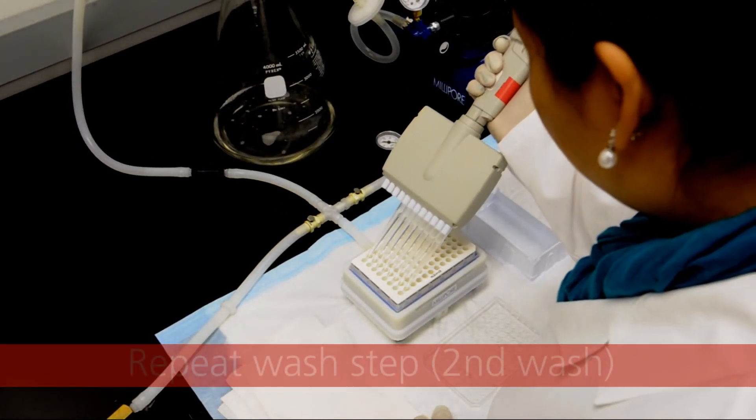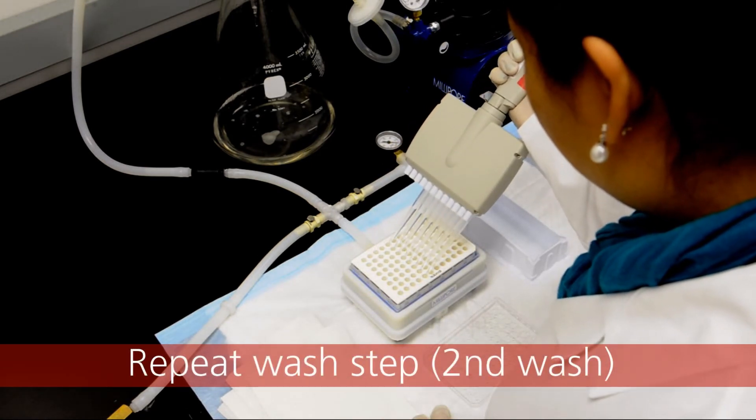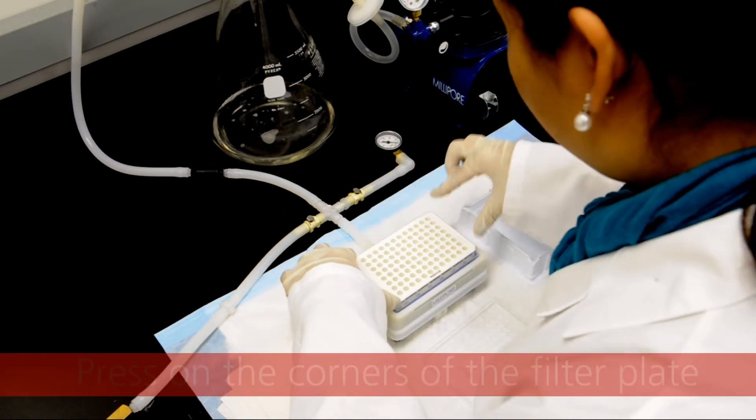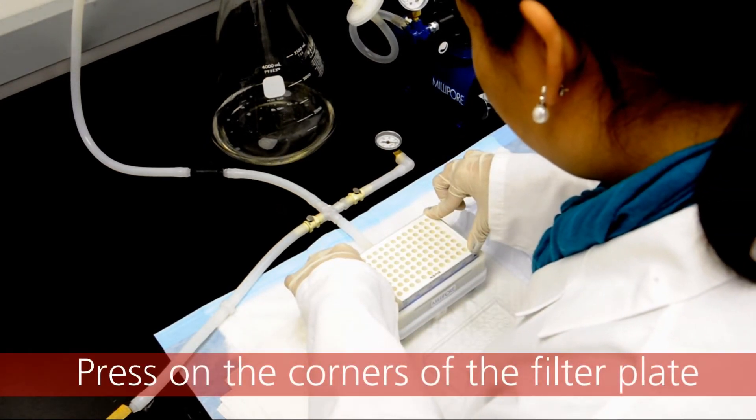Wash the plate a second time by pipetting 150 microliters of wash buffer into each well. Turn on the vacuum manifold and evenly apply pressure to the outer four corners of the plate.